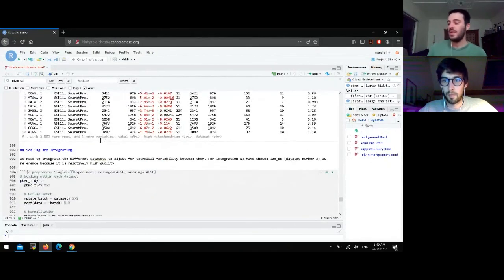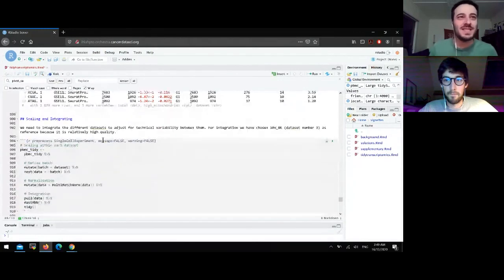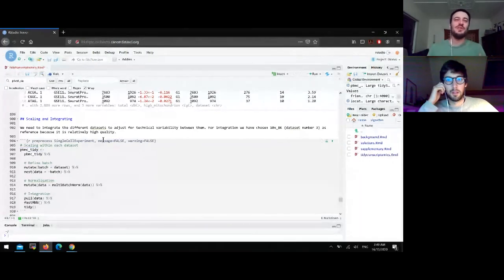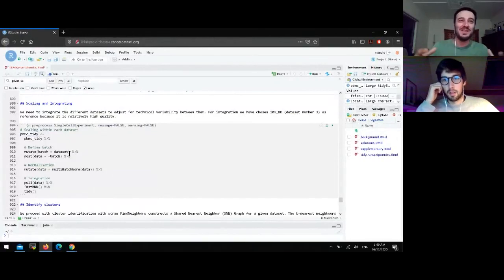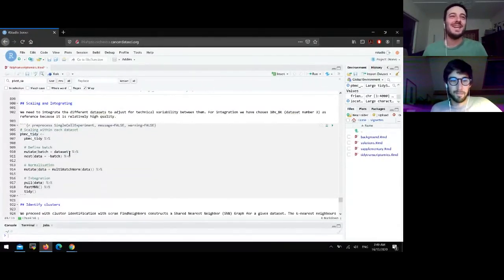Okay, so we have roughly 20 minutes. I'm not sure I will go through all the material, but I will just show you a few other examples. You are free to get back to this on the website of the workshop to get a better understanding of all this. I'm aware it's a bit overwhelming, especially if people are not experienced with this kind of analysis, but still bear with me.